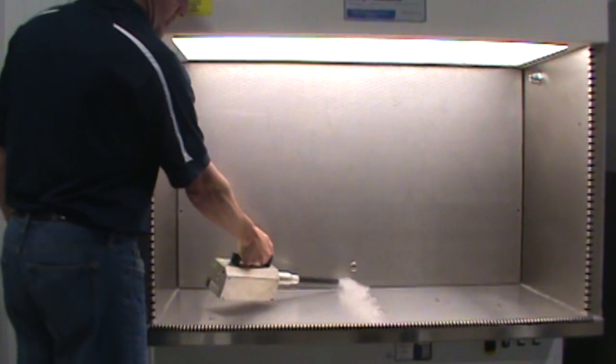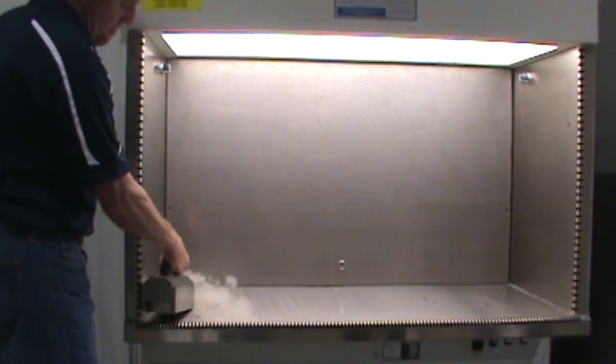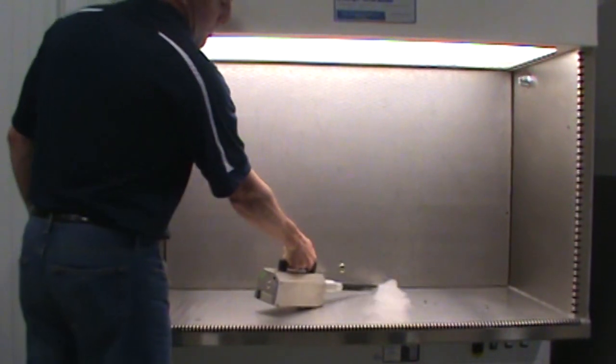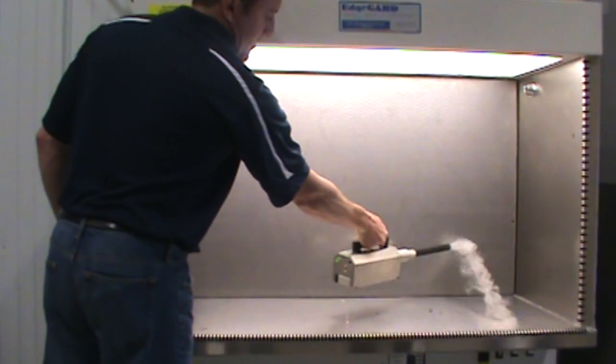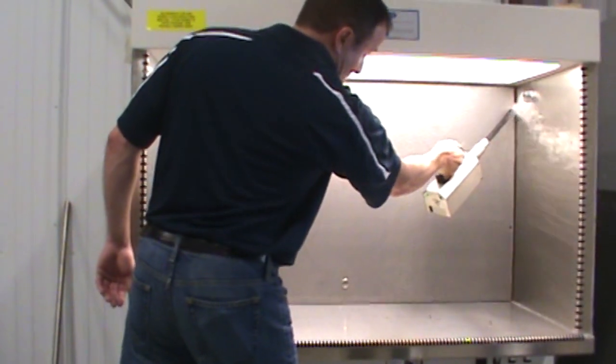EdgeGuard HF's diffuser option provides a simple solution that prevents cross-contamination. With the diffuser in place, the smoke is pushed straight forward out of the work area. Particulates never have a chance to migrate across the work surface, protecting your work from any aerosols that may be produced.